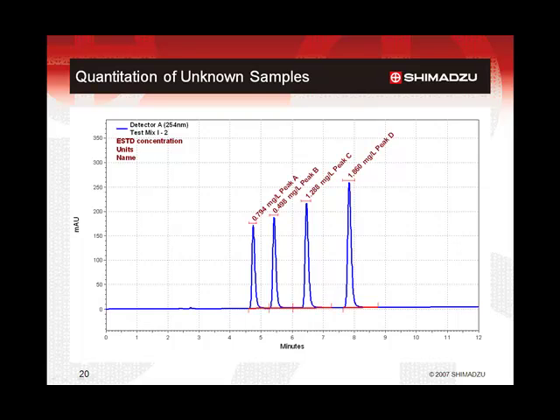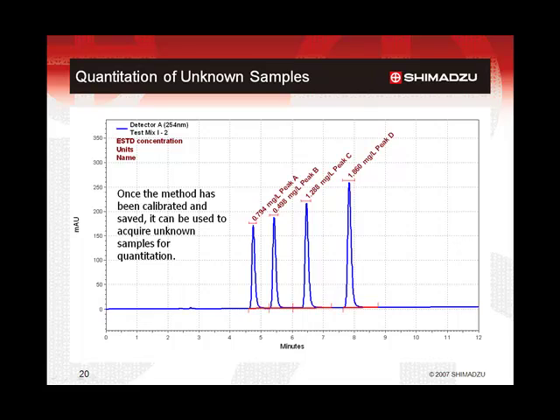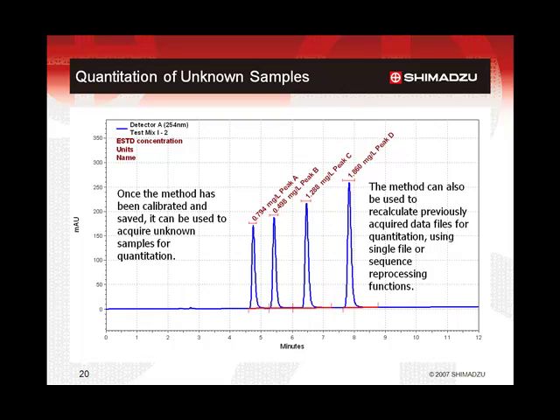Acquisition of the chromatogram of an unknown sample using the calibrated method will permit calculation of the concentrations of the analyte peaks based on the equation of the calibration curve line. The calibrated method can also be used in a reprocessing mode, either one file at a time or in a post-acquisition sequence, to recalculate the quantitative results of previously acquired data files.